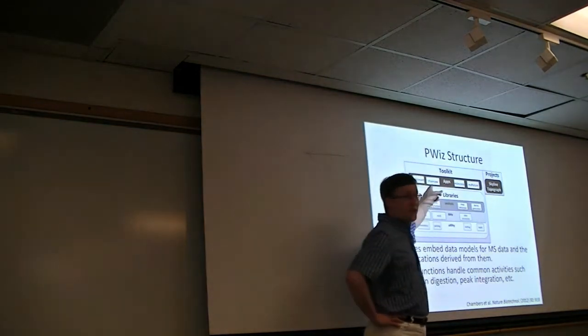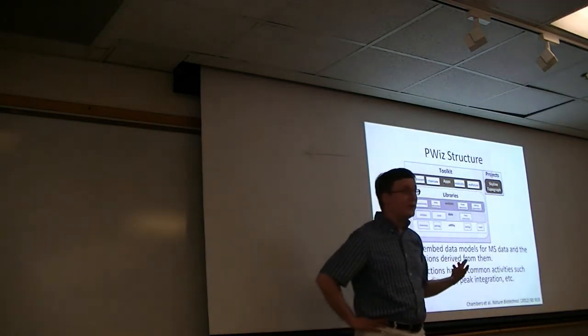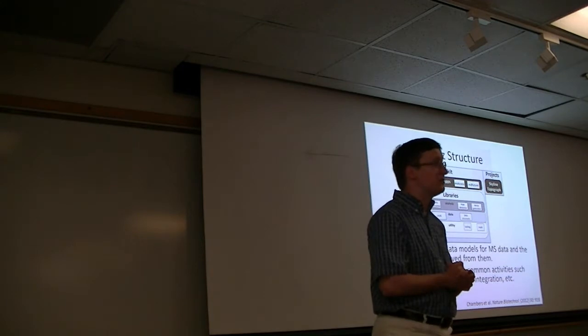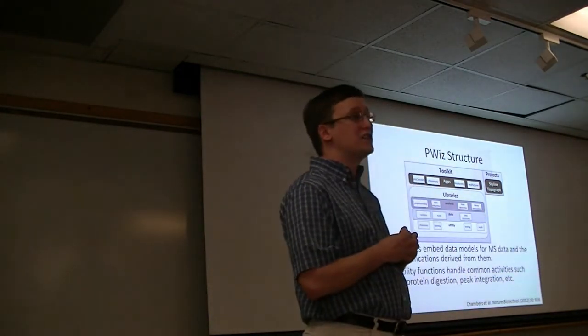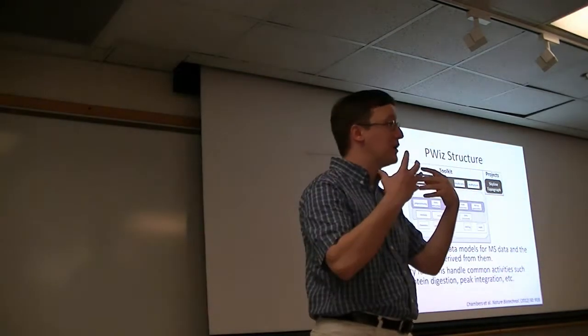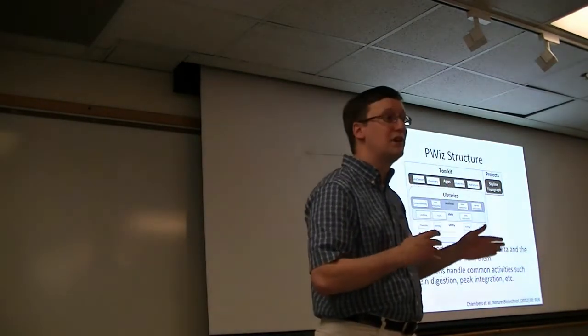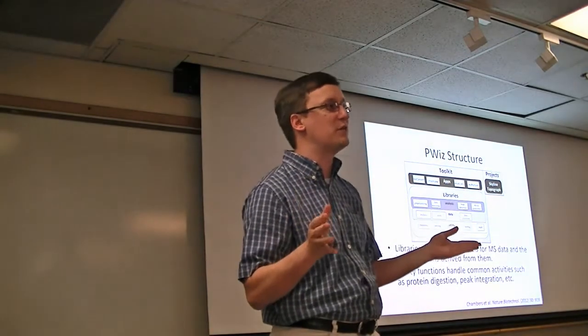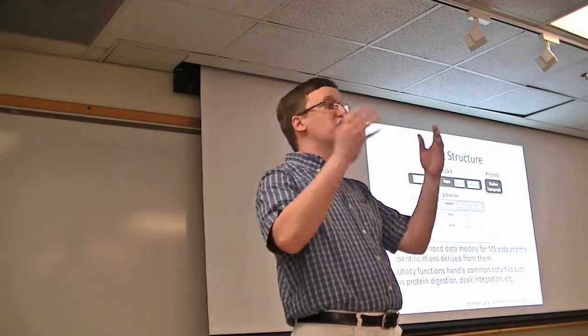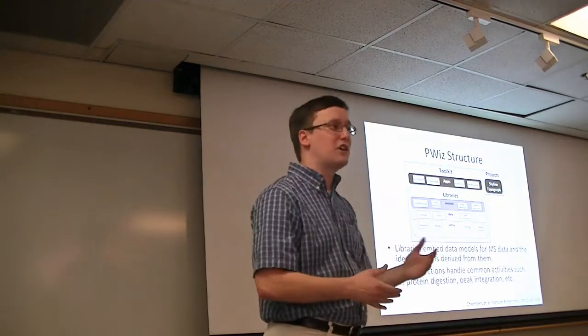We also have things like Chainsaw, which are a little less well known, but if you're doing certain curious projects in proteomics, having Chainsaw is very, very valuable for you. Chainsaw is designed to accept a protein sequence database and chop it up according to your favorite protease. So if you want to know which peptides would be produced from this database with cyanogen bromide, Chainsaw is going to help you out.